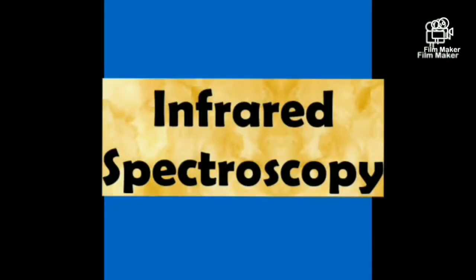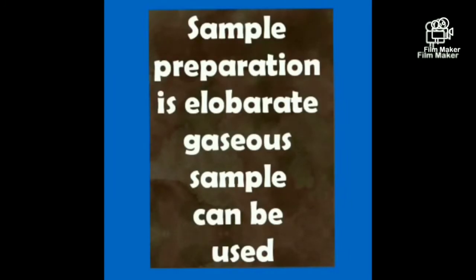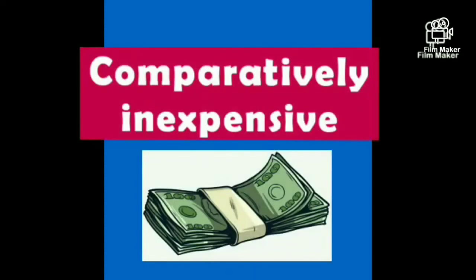Next, we proceed to infrared spectroscopy. Infrared results from light absorption by vibrating molecules. Infrared results from changing dipole moment. Sample preparation is elaborate, and gas samples can be used. Comparatively inexpensive.